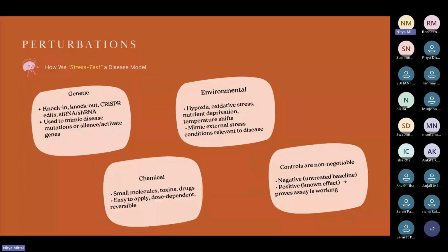Now if you didn't have an iPSC and you just had a day 3 and day 10, you might not be able to say which one has been differentiated more if the time difference was not a lot, right? Between day 3 and day 10, you'll have to see, okay, which one has a more mature neuron marker versus which one has a less mature neuron marker. Becomes a little bit confusing, and then you don't really know what it compares against with the iPSCs.